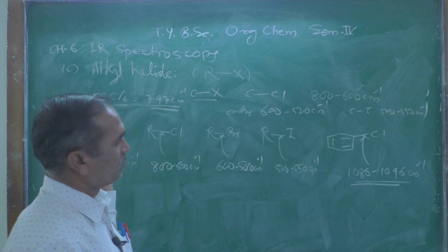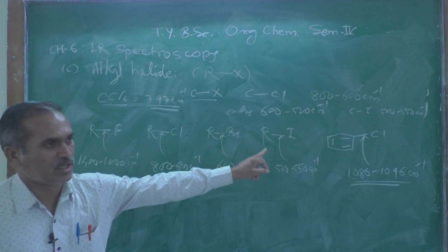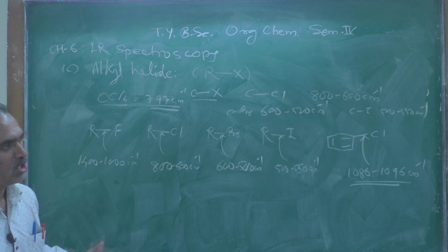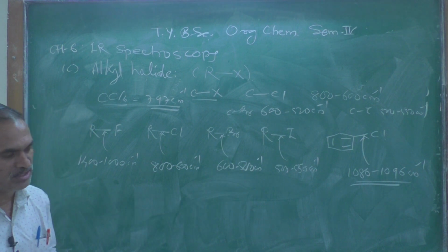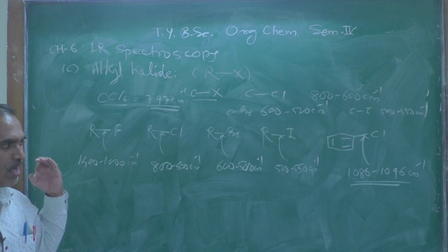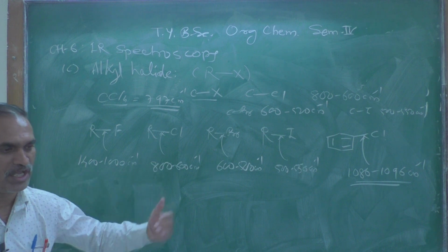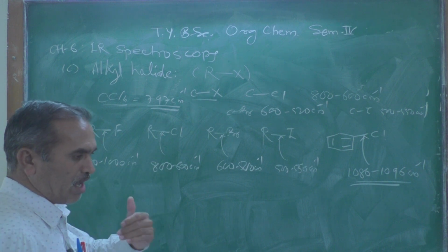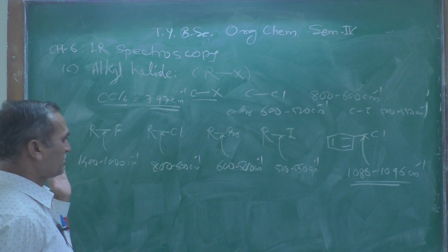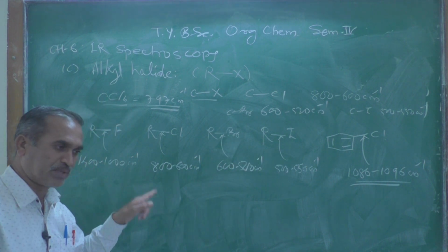And if you observe these structures and IR absorption peaks, or these stretching frequencies, you will observe a gradual increase or decrease in IR frequencies as you move from the right-hand side to the left-hand side.